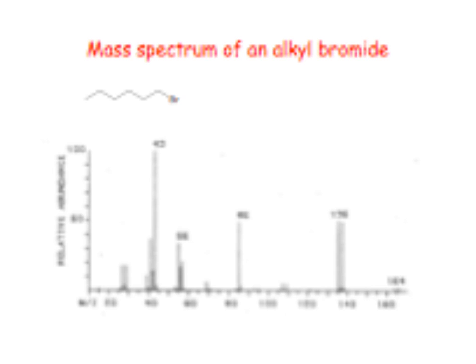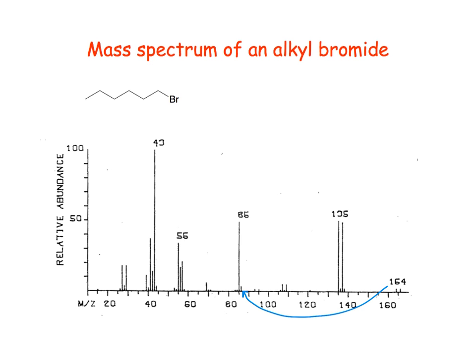All right, so this is back to one of the spectra that we looked at before, right? When we were just saying, what does the presence of bromine look like? But we didn't know, other than going from 164 down to 85, how any of the other ions formed. So, just to get to 85, we need a mechanism by which we could lose the bromine. And that is likely to be just a cation initiated cleavage, right?